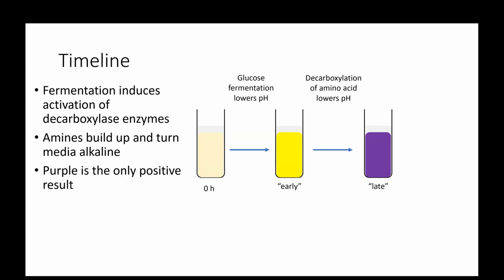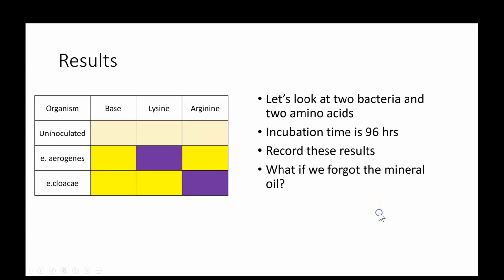So you want to be very careful anytime you do a decarboxylation test to look at what the literature says to wait for the incubation time on these. For example, I think the lysine and arginine decarboxylase tests that we would have done in lab take a minimum of 96 hours to turn purple. So we want to make sure that we're taking our time and giving that bacteria plenty of time to decarboxylate those amino acids.